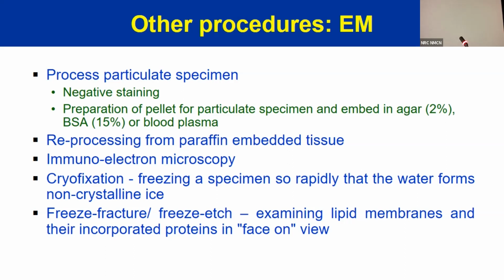So your background is stained, but your thing of interest remains unstained. That is known as negative staining, and we can use it for virus particles in electron microscopy. So it cannot be used just for tissue sections, it can also be used for viral particles, particulate material. It can be stained like a negative stain.